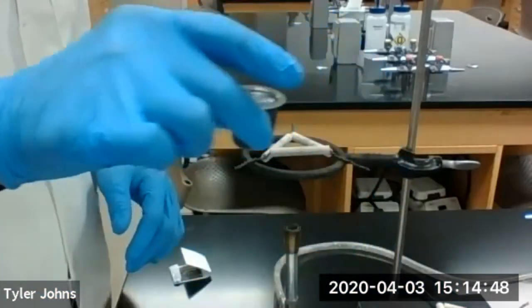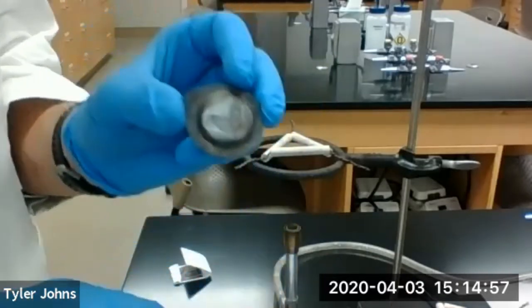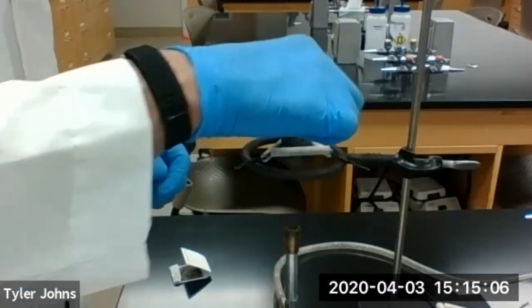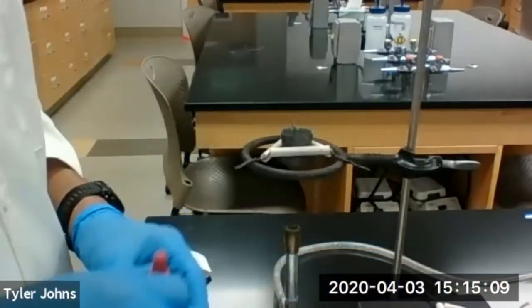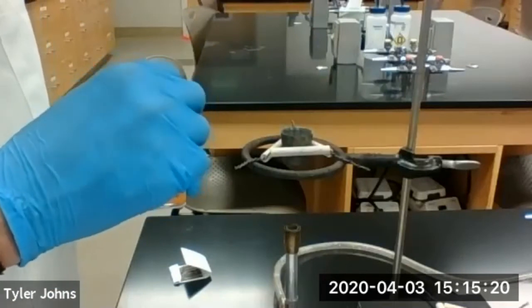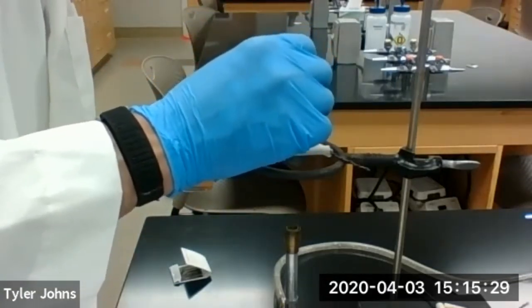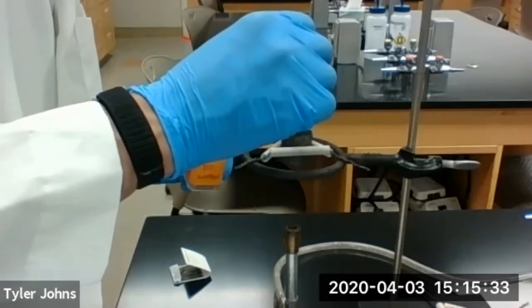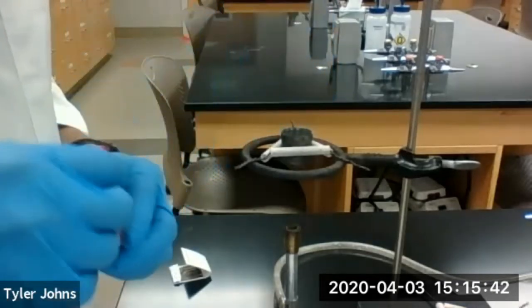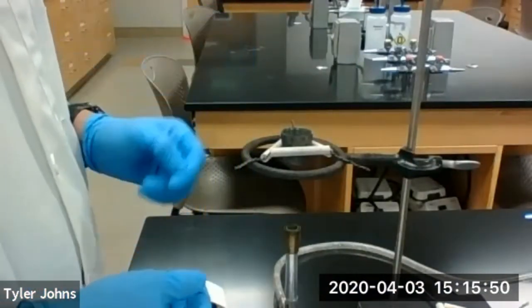Our crucible is now just warm to the touch. We're not going to need the crucible cover, so I'm going to remove it and set it off to the side. Put our crucible back on the clay triangle. Now we're going to add 10 drops of DI water, making sure to wet the entire surface of the sample, not just one spot. Now we're going to turn our Bunsen burner back on and warm the crucible with the damp sample inside for about a minute or so.